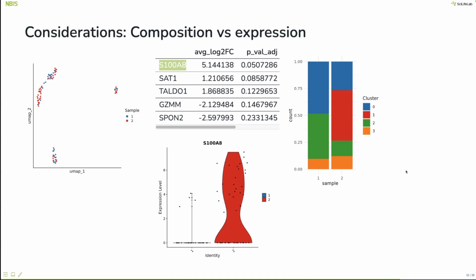And you tend to go a bit back and forth between what is more relevant to show. And then once you decide, often you'll decide, okay, well, then I'll just look at this cluster and see the differences between the samples in this cluster. But then you might also have subtypes, and is it then more important to look at the composition of subtypes or the gene expression? So just keep this in mind, that you're always looking to some extent at heterogeneous populations.